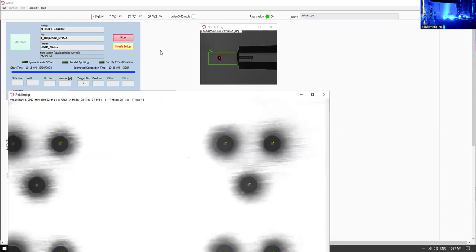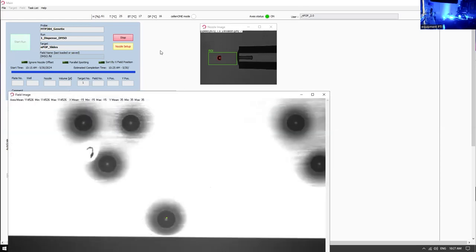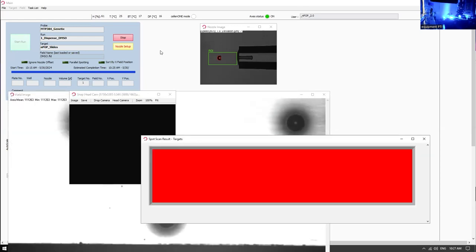Fresh is the best, right? Everyone agrees. And so essentially that's going to be the best. Sometimes it's impossible to get those. You're getting frozen cells. We have some protocols for gentle thawing. We also have some recommendations for how to freeze cells to avoid affecting the viability a lot.